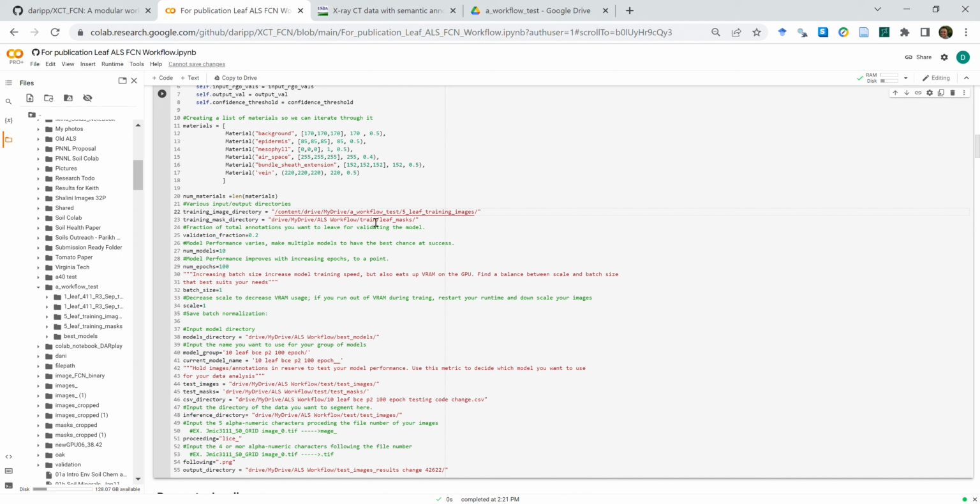And so we're going to just repeat this. Here we're going to copy the path for the masks, right? So we've done that. And now we're going to copy the path for the best models. And again, we really want to make sure that that / is included at the end so that it will read and write into these folders.